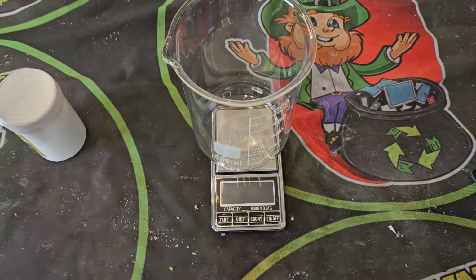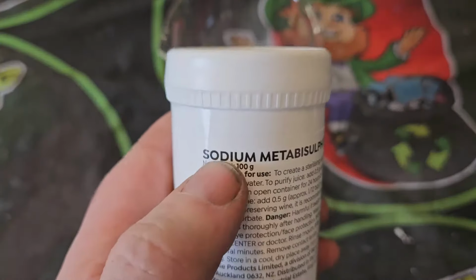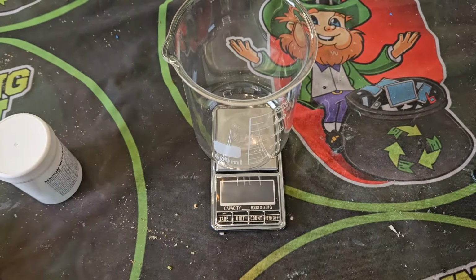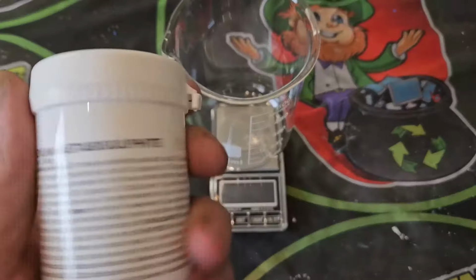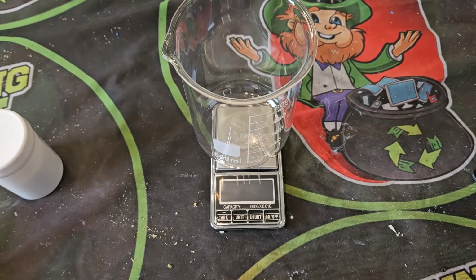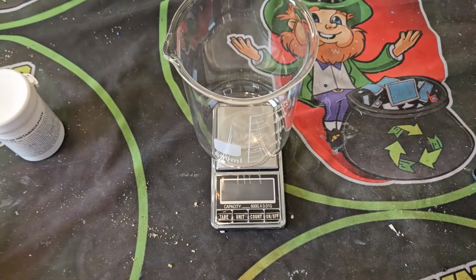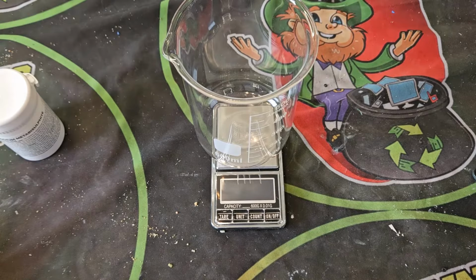So we'll be mixing up some of the SMB. So for this SMB, as you see here, we have the sodium metabisulfite. So I'll be mixing that in there, and I'll probably just put in a gram to a gram and a half of that, because there will be a certain amount of acid that it will use up. It has to be neutralized as well before the gold drops out. So hopefully a gram and a half will be enough to get the gold dropping out, to get me my third of a gram of gold. So we'll get this measured up. So let's get that going.